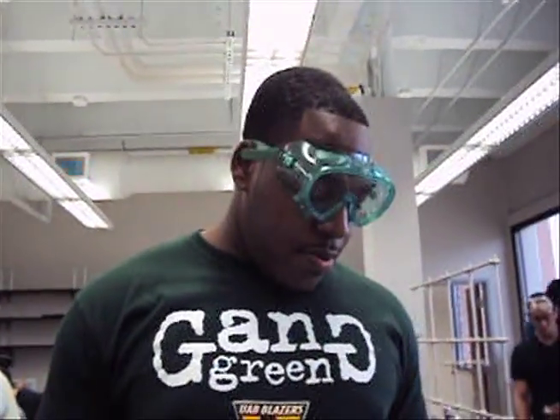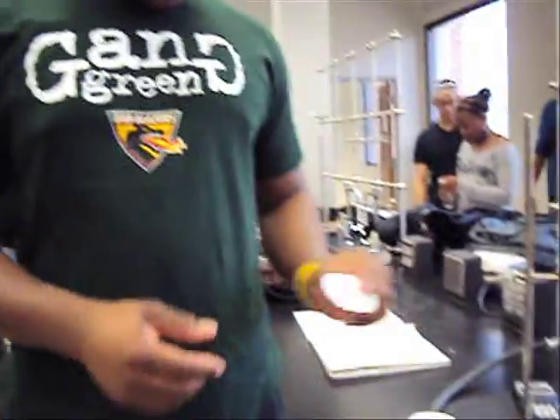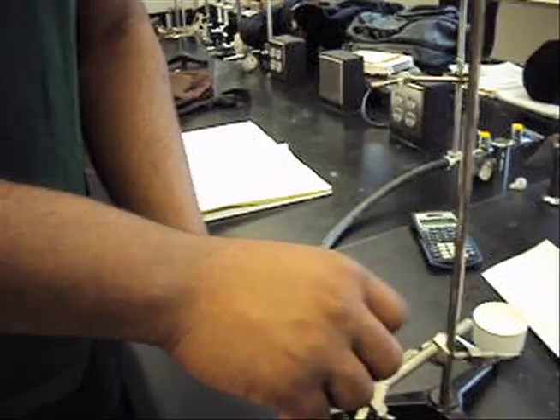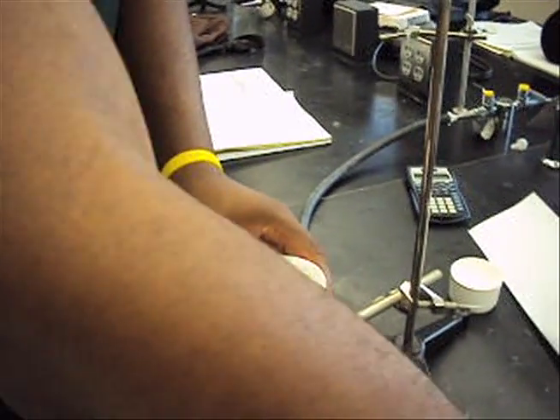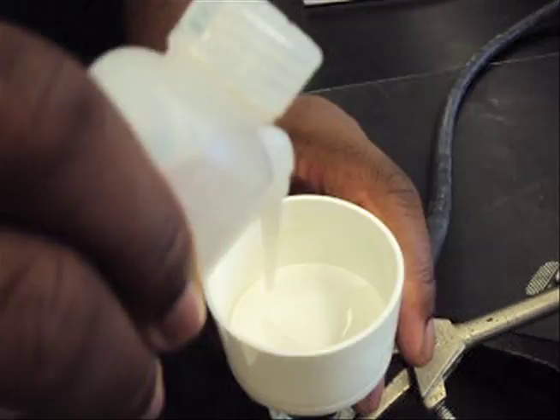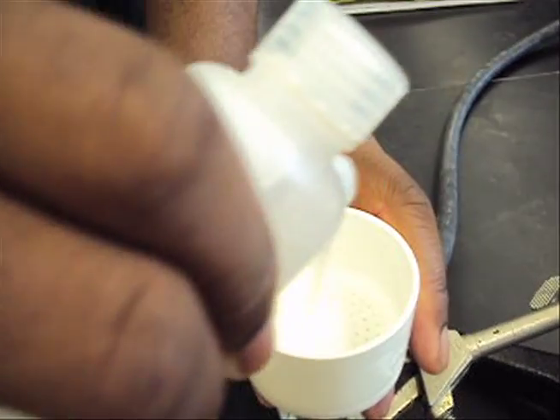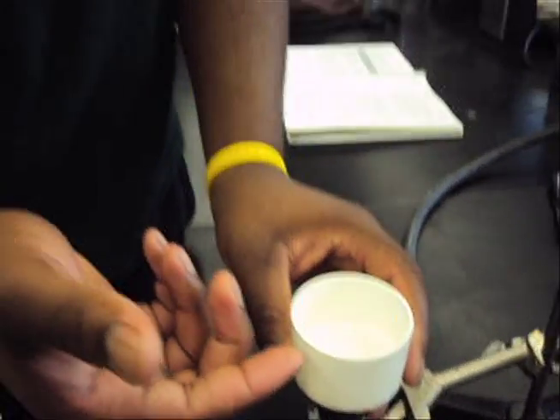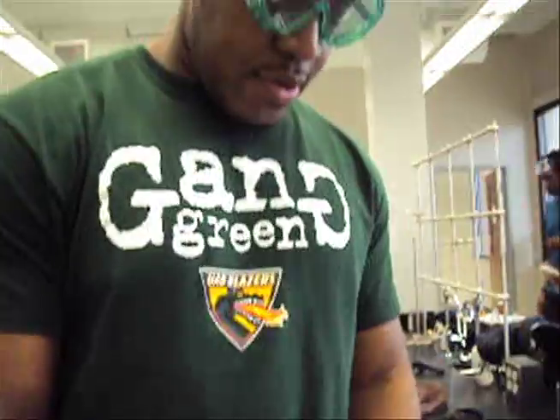My name is Casey, and I'm here to put the filter paper inside. Once you put the filter paper in, you're going to wet it with deionized water. We do this because we don't want the precipitate to end up underneath the filter paper — the water will make it stick to the funnel.